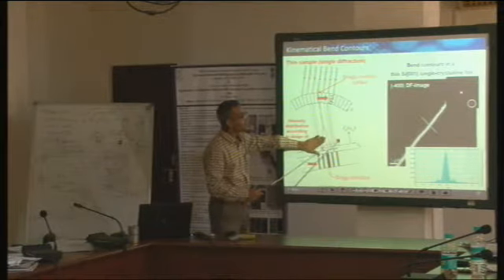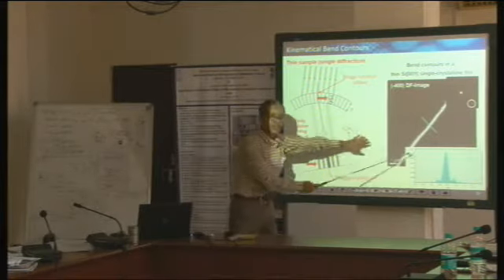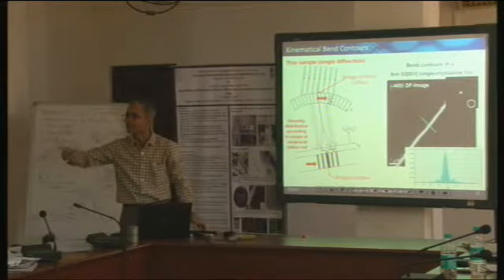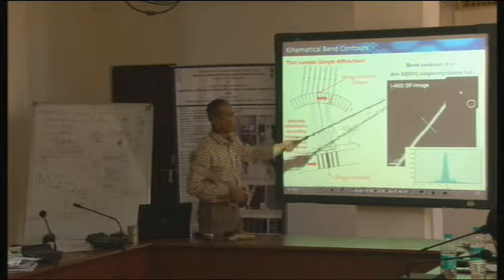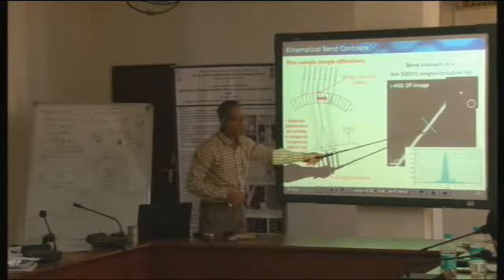This is the intensity in the diffracted beam, and here is a dark field image, and as you know, dark field images are made with diffracted beams, right? So here is some silicon sample, and they have used the 400 diffracted beam to make an image, and this is plotted here.